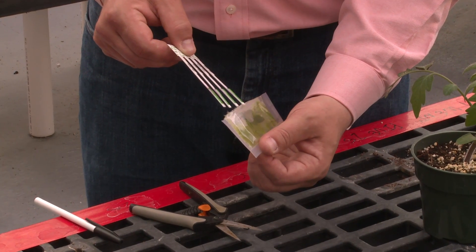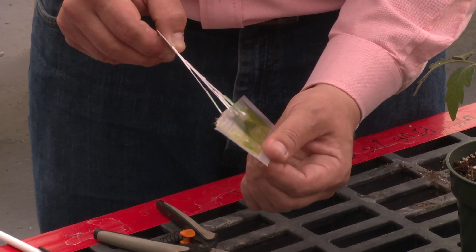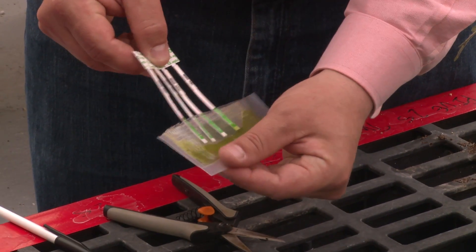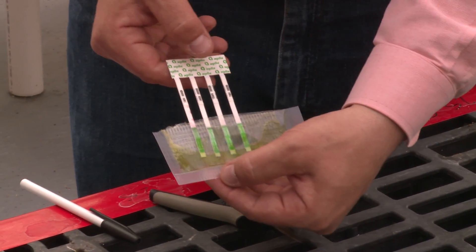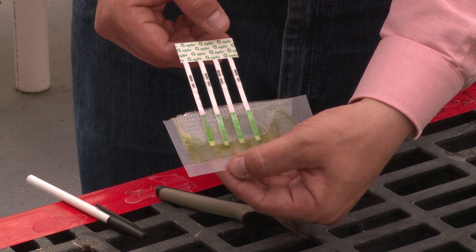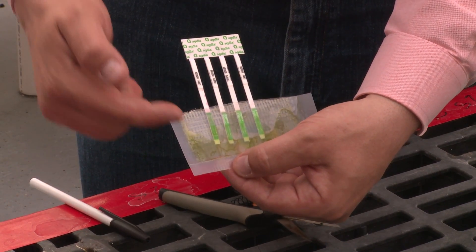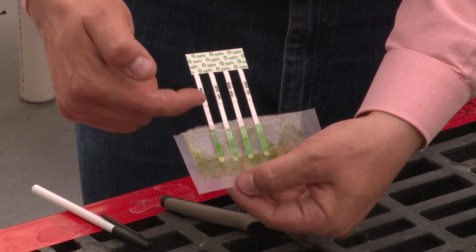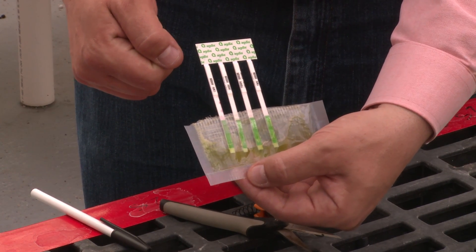Go ahead and place the strip in the solution. Once the tip of the strip is submerged, allow it to sit for anywhere from five to 30 minutes and draw that solution of buffer and macerated plant tissue up the strip, which is ultimately going to help us identify our viruses.